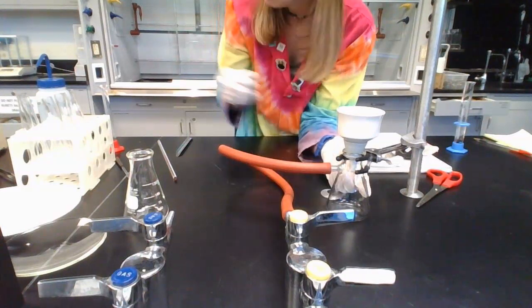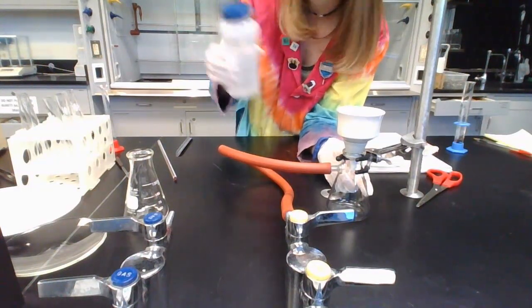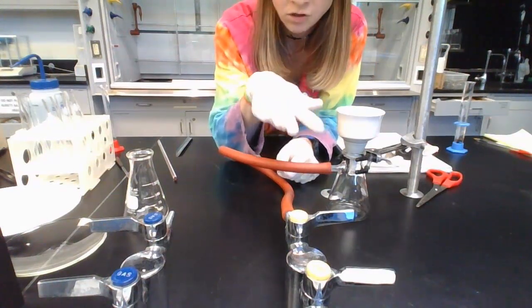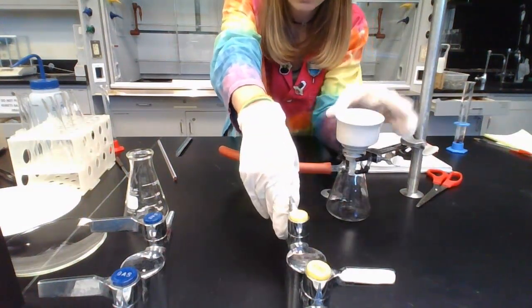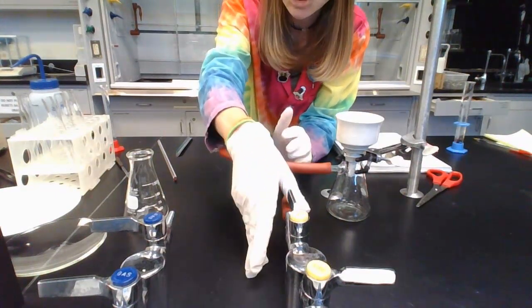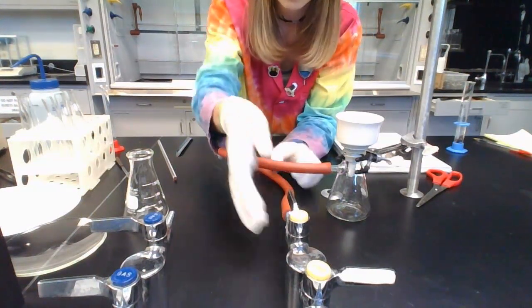So we're going to start by just spraying some deionized water on it, because what I want to do here is wet the filter paper so it sticks, so no solid can get underneath it. So when you're ready, you just turn the vacuum 90 degrees. And I don't know if you can hear the little bits of sound. Okay, so when you're ready to shut off the vacuum, so like at this point, it's pulled the liquid down, there's nothing else to do.